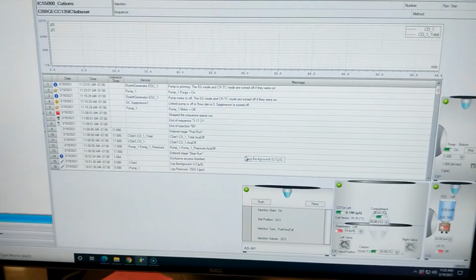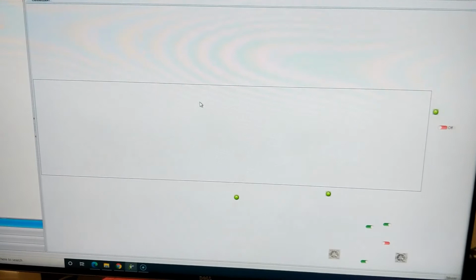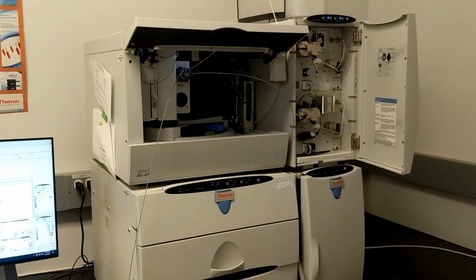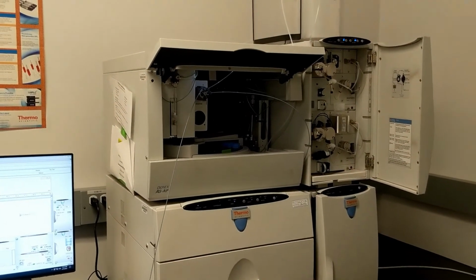Now we need to do the same thing for the anion side. Again, don't worry too much about this software. We're going to cover that in just a second here. But same thing, right? We open both the valves, so we're going to prime them both. Same thing, execute despite warnings. Now, this will take about 5 minutes. So as soon as that's done, I will tell you what the next thing to do is.